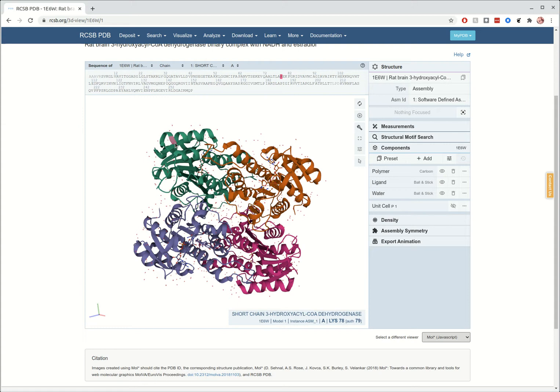You can also see that it's highlighting, right? There's that little piece of the spiral highlighted. That's actually a specific amino acid in the chain. It's highlighted in pink on the green subunit. It's highlighted in pink on the very top in that long list of letters. And then down in the little box at the bottom, it's there again, and it's also another A. So what is that? So that A is the subchain.